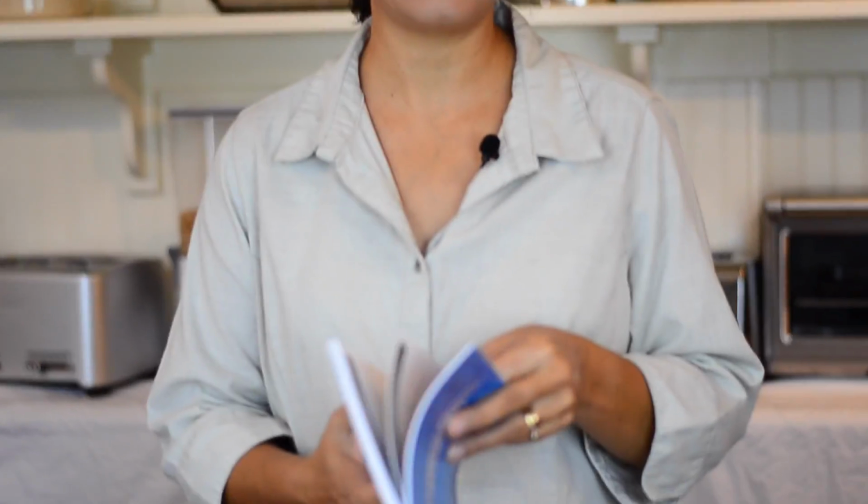This is the book that we're using. It should have come with your microchemistry supplies, the kit that you ordered for this class. If you open that up to page 16, you'll see the beginning of the experiment, the list of materials and the procedure for us to follow. We're going to start off by running quickly through our reagents and equipment list to make sure that you have everything ready.